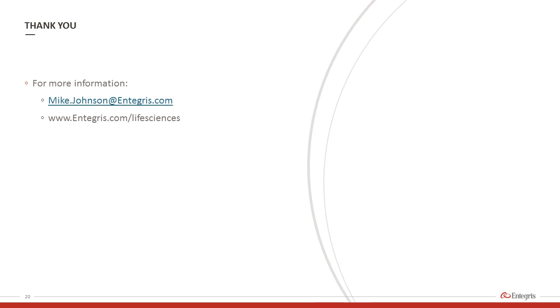Would you expect the same results from other fluids? I think this is, again, going back to the factors that impact permeation. Other fluids may have a greater tendency to permeate through both of these bags or less. I think it needs to be looked at on really a solution by solution situation here. So I would expect the results to be somewhat similar, but again, it is somewhat solution specific.